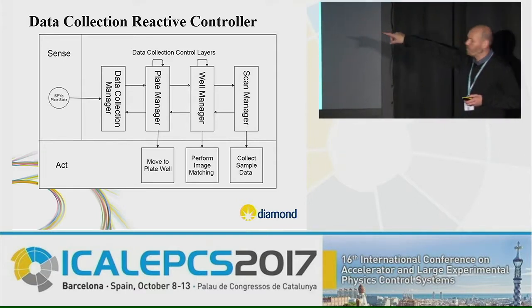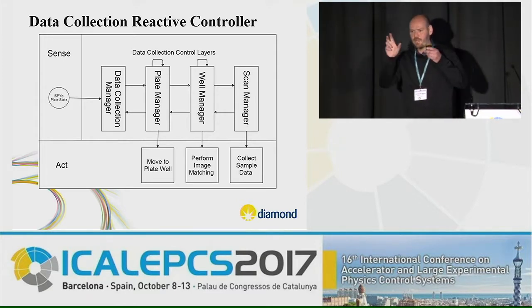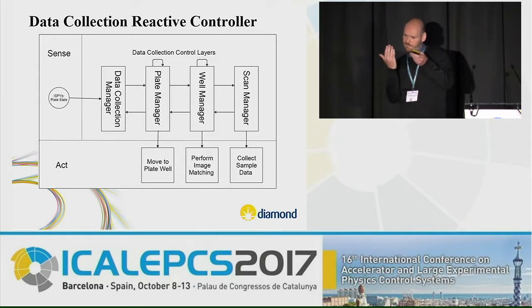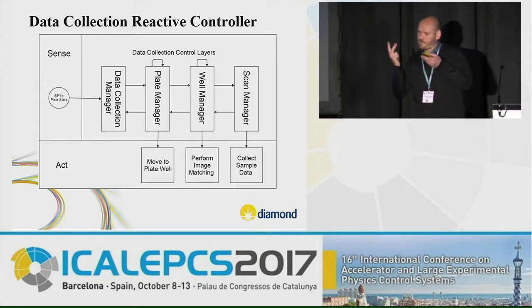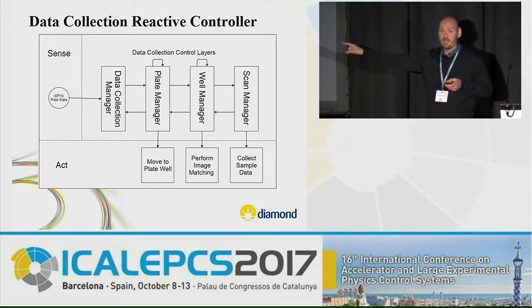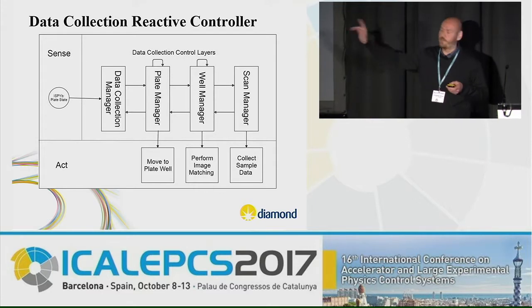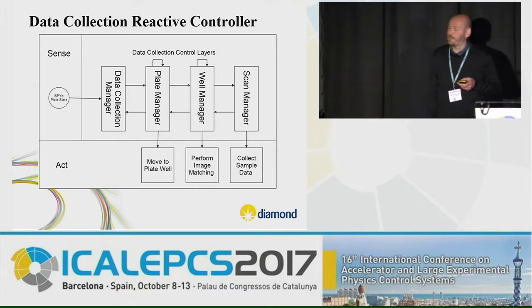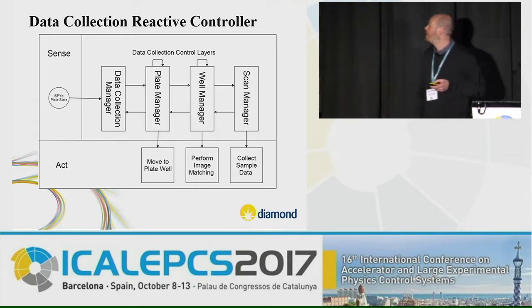Now, interestingly here on the image matching, what happens is the crystals may move when they're being transported, or they may be grown. So we may have a mismatch between what the users originally marked and what is actually in the crystal now. So we have to do a process of image matching. This is a computationally intensive task, okay? So according to our model, we kick this out. We don't do image matching internally at all. This is something that is done as an external service.